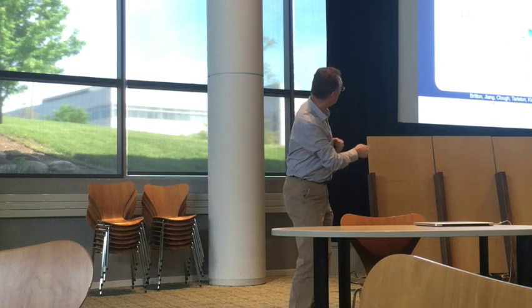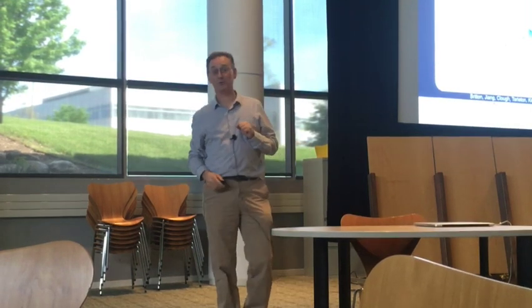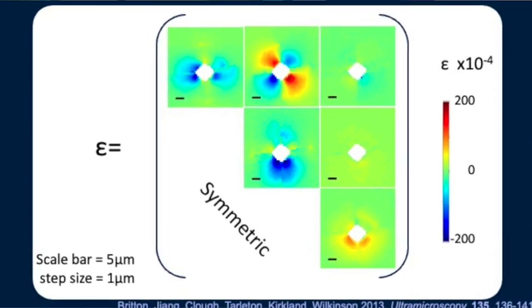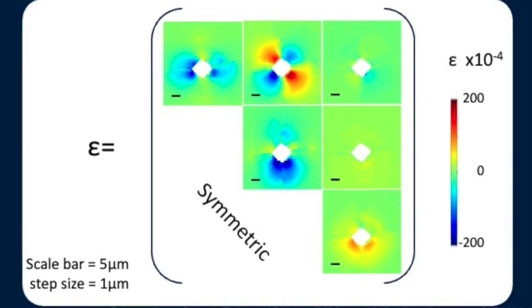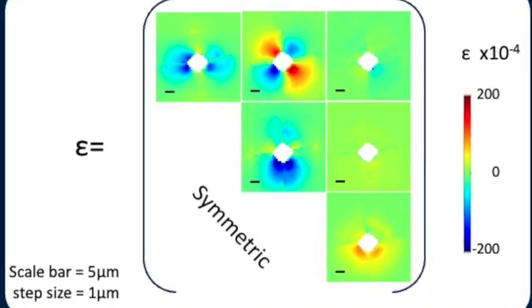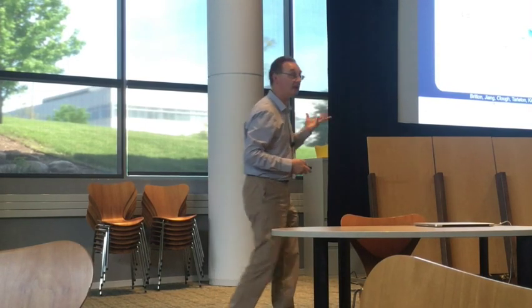The shear terms in here, you can see these two colourful lobes in here. If you look at those and apply Mohr's circle in your head, you'll see that those are kind of equivalent to what I've got on here. So these are lobes of about 45 degrees in here. So rotate it round and it'll tell you that there's a compression along this axis and actually a tension, because we don't have a crack in this instance here. It's not a cleavage plane. So this all kind of makes sense.